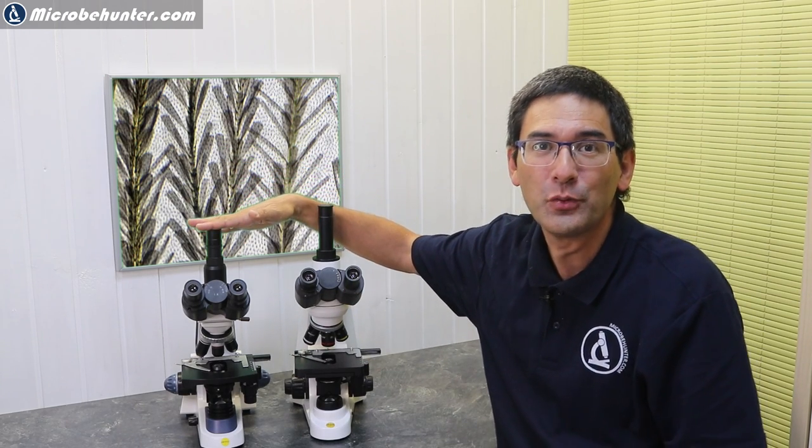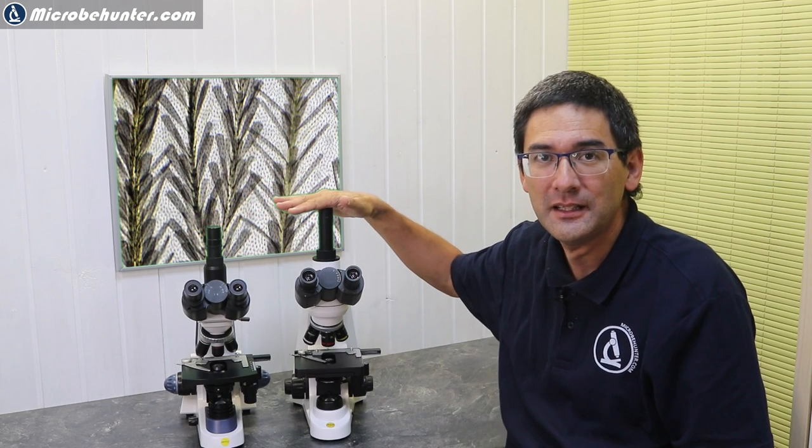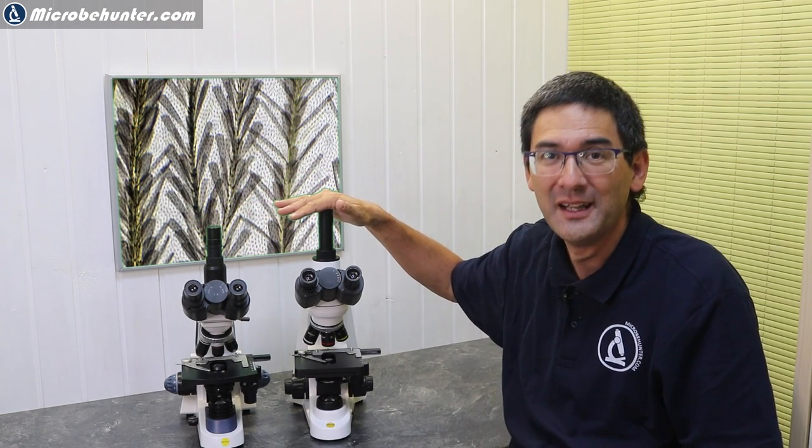This is the Swift SW300 ATT and a newly released microscope, the Stellar One, and in this video I'm going to compare both of them.